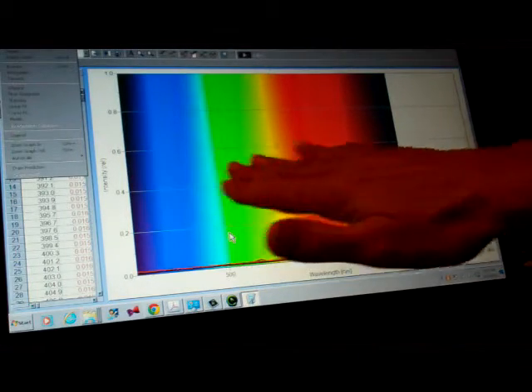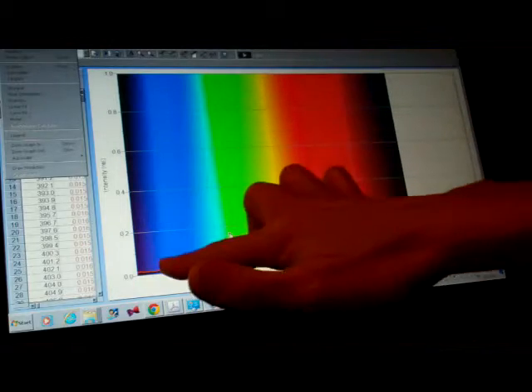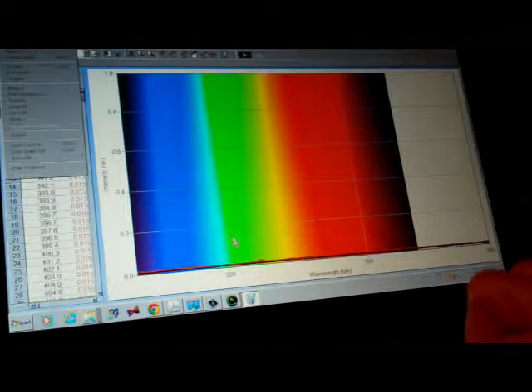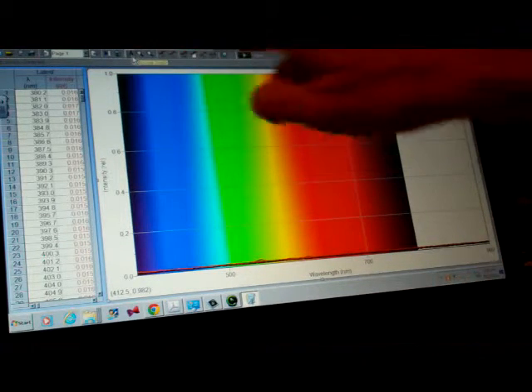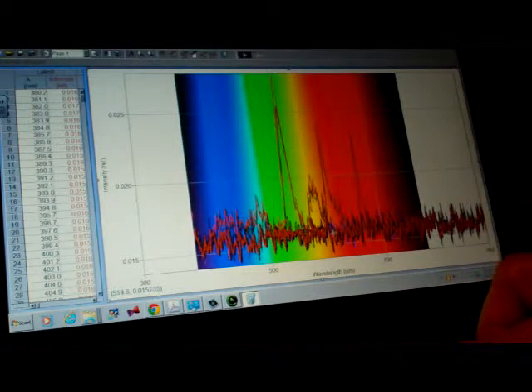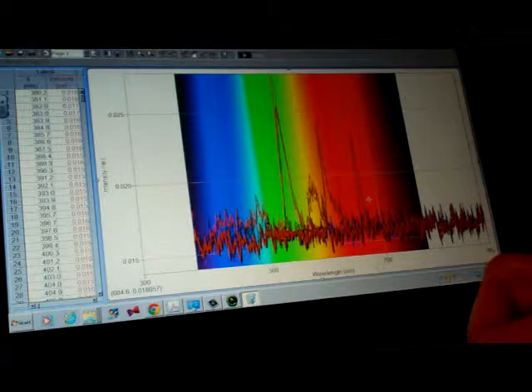And what you'll notice is the spectrum from the burner, and then down on the bottom are some lines. We see a few bumps, but not really something we can analyze in depth. So what we're going to do is modify the graph. First thing first, click on Auto Scale, the big A on the top menu bar. And now we have a lot of lines and a lot of peaks, and their various colors.